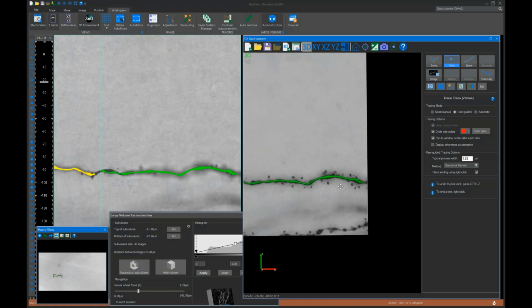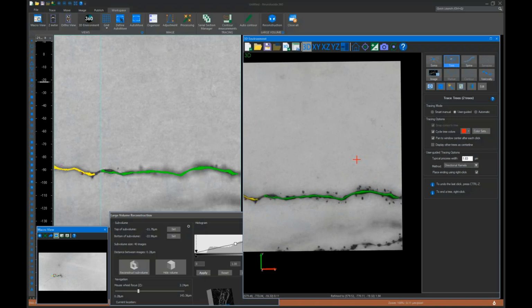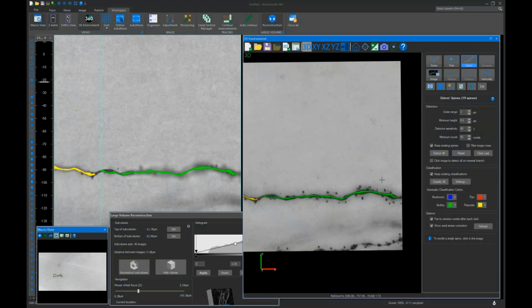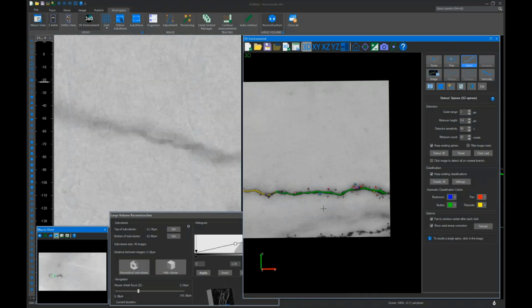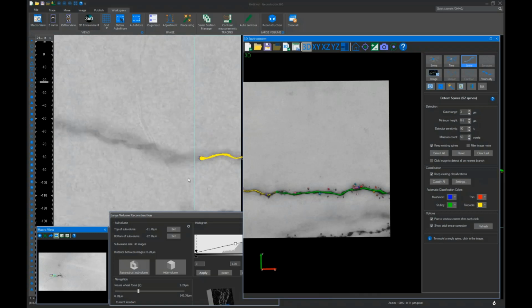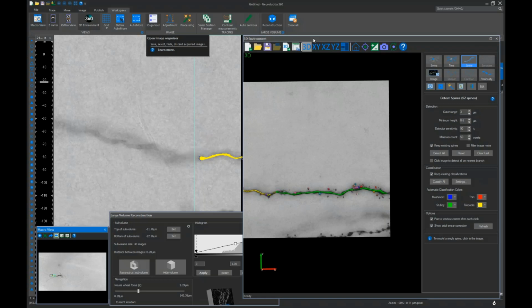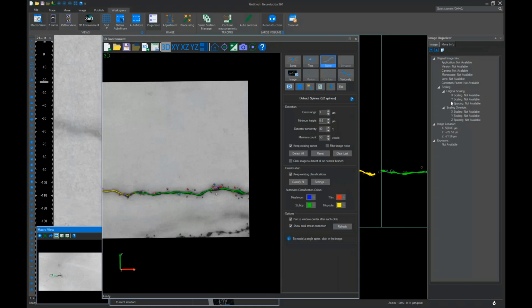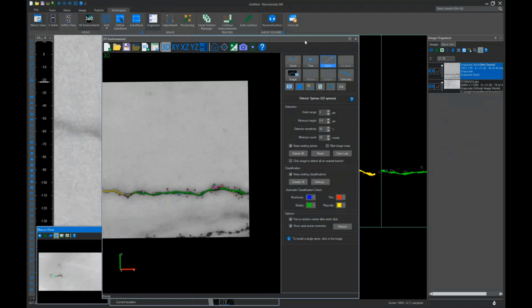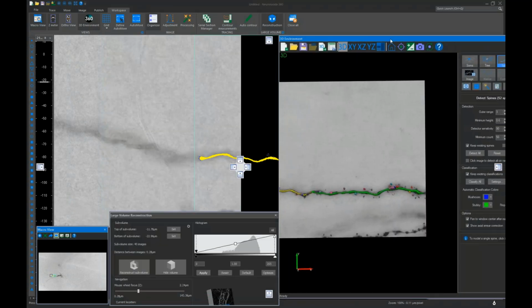Isabel is asking a question about wanting to know more about this particular image volume. This image volume was provided by the Allen Institute for Brain Research. This is a cell that had been previously recorded from, and the step size is 0.28. And I'm just going to take a look to check out the XY location as well. So the scaling information is, this was acquired at 100x.